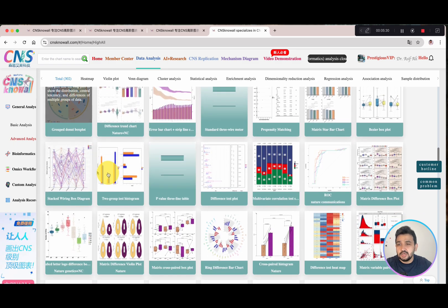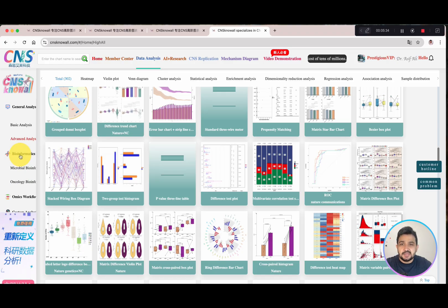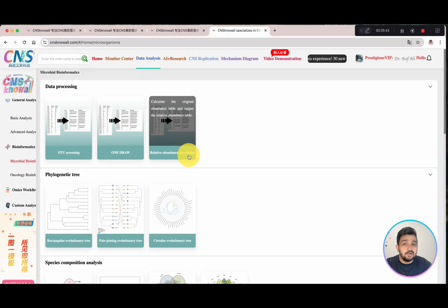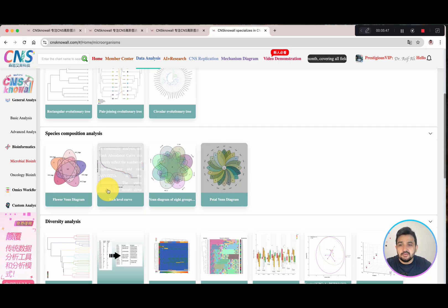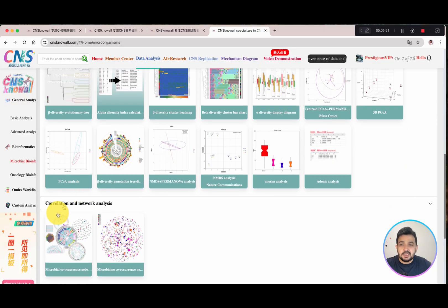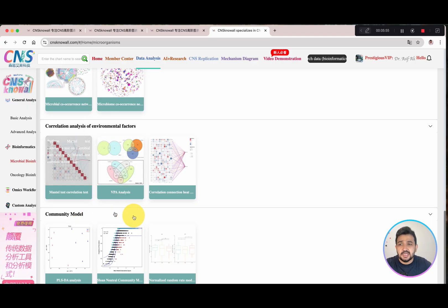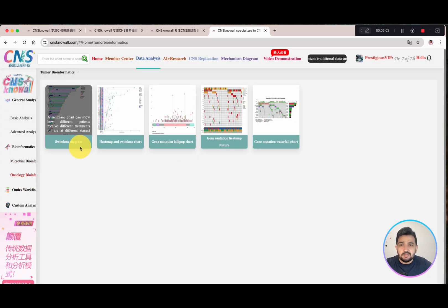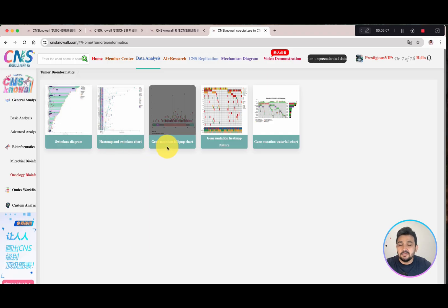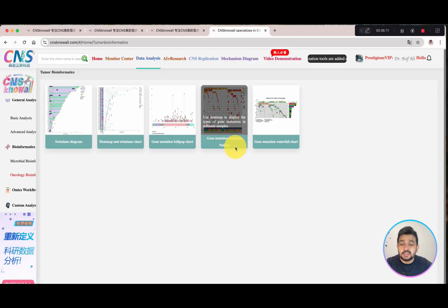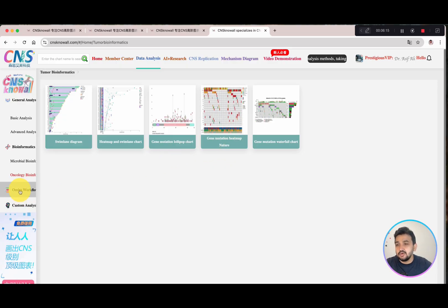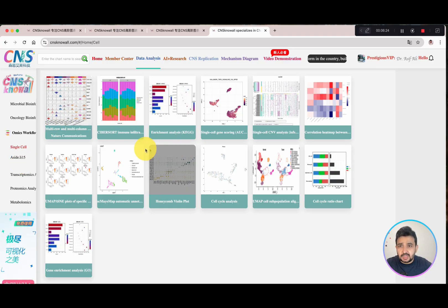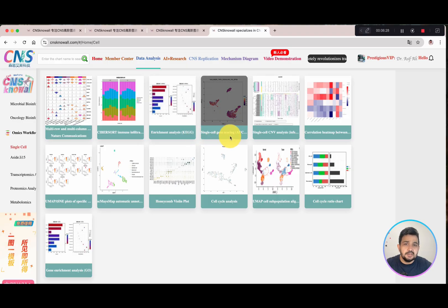They also have SOM clustering, donut box plots. In the bioinformatics section, there is microbial bioinformatics with OTU screening, one-click relative abundance, correlation, circular evolutionary tree, diversity analysis, correlation and network analysis, and community modeling. In the oncology bioinformatics section, they have swim lane diagrams, heat maps, gene mutation lollipop charts, and gene mutation heat maps published in Nature. In the omics workflow section, for single-cell analysis there are over 15 steps including enrichment and single-cell gene scoring.